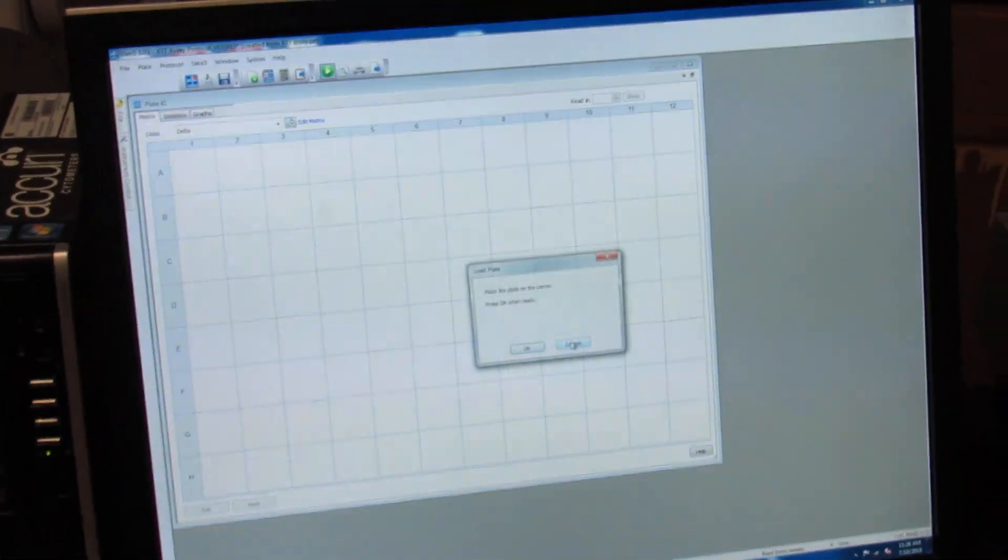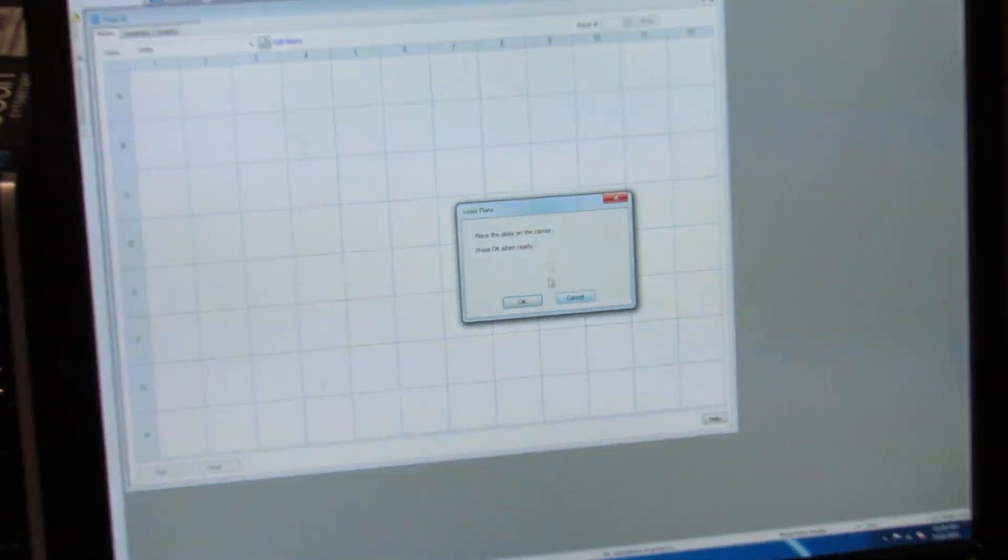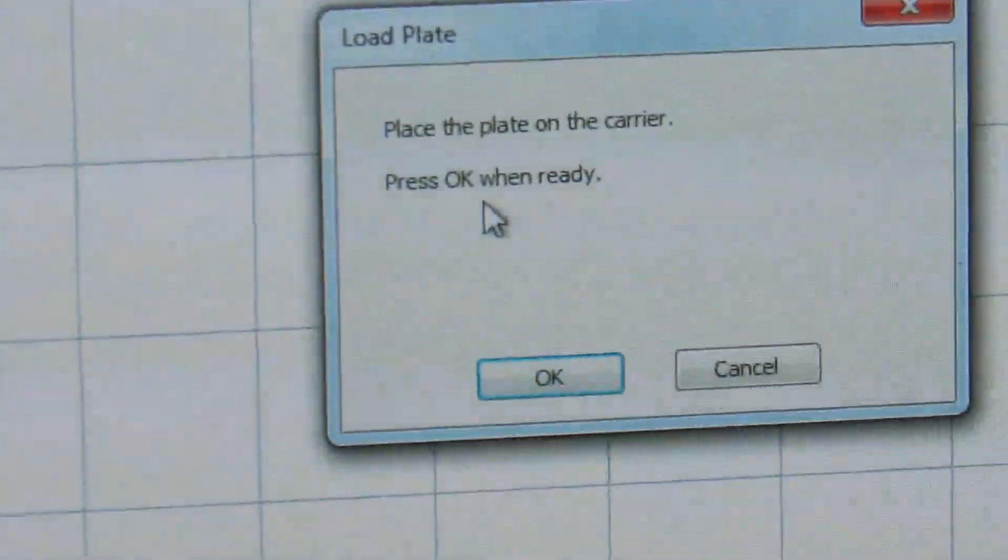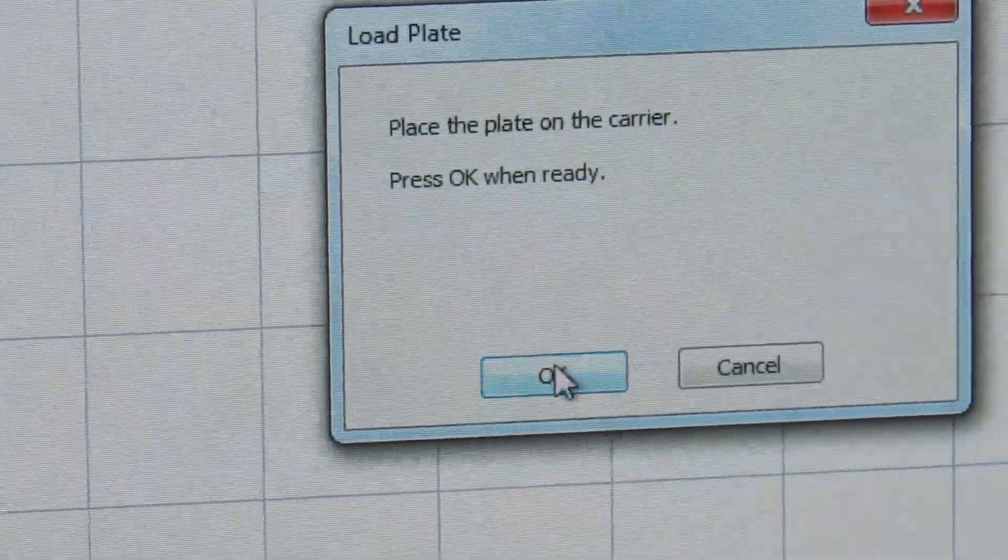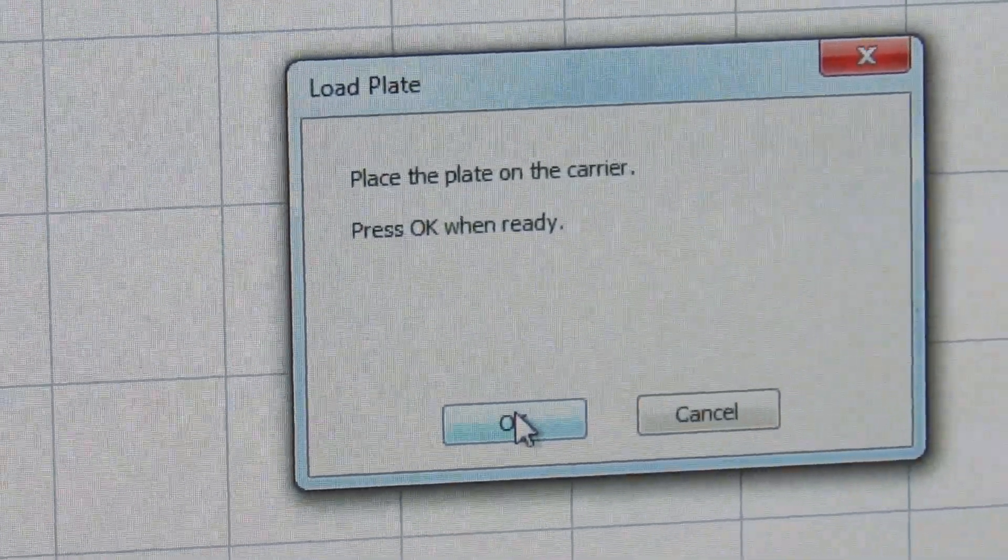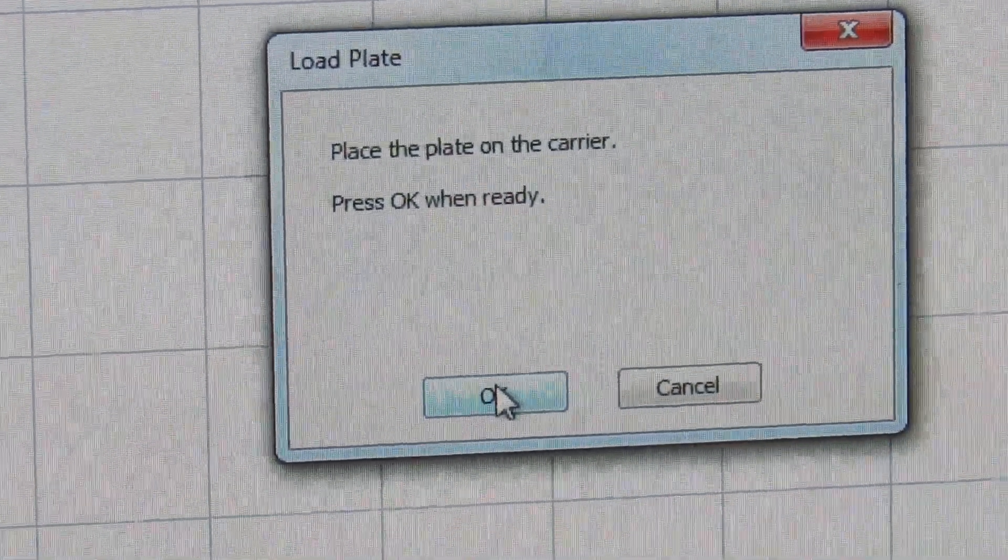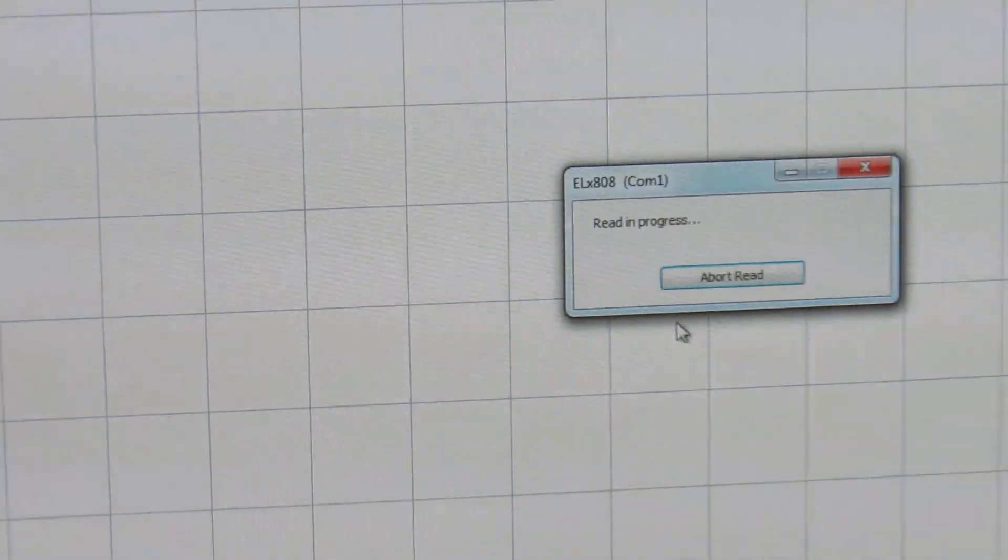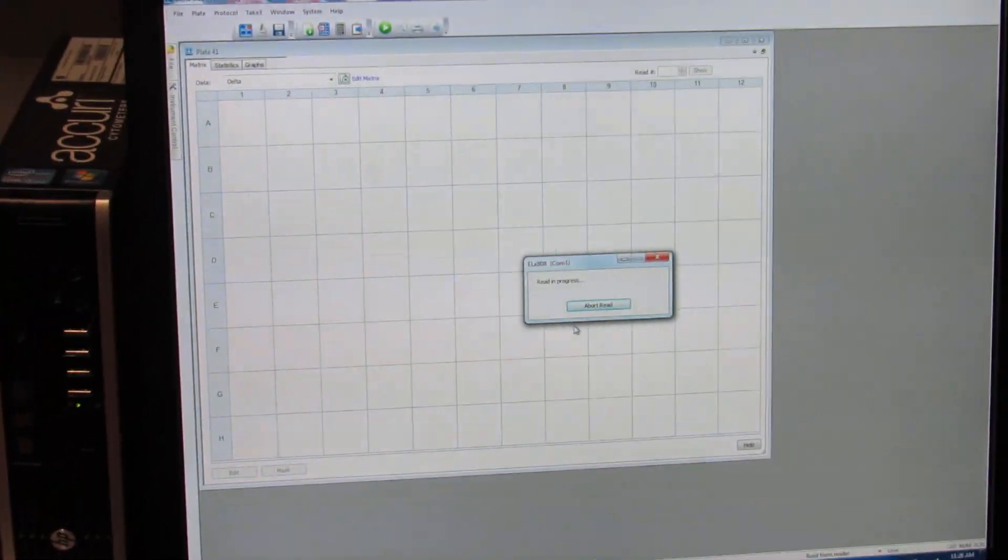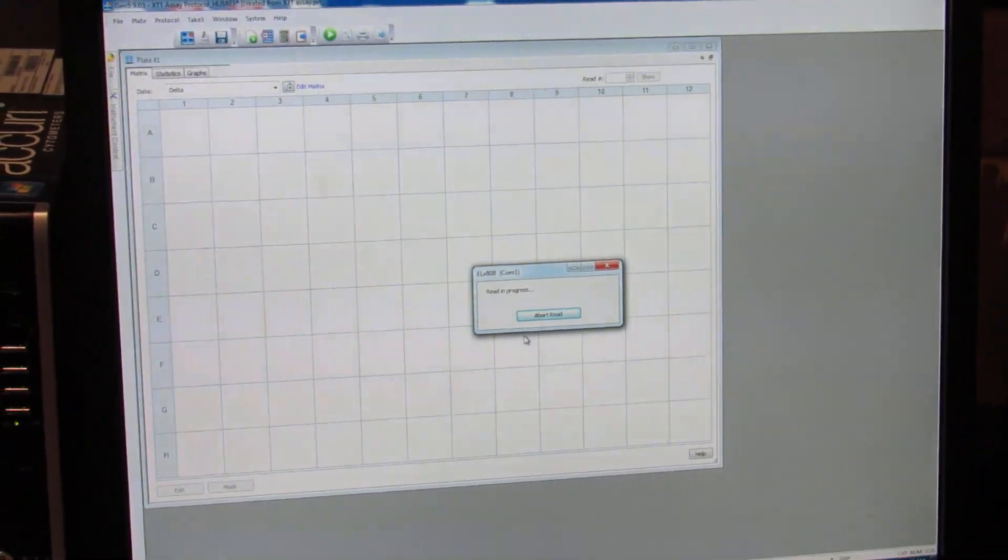The plate reader is now detecting whether or not you have inserted your plate and then it's going to ask you if you are ready to begin. Once you've placed it and it's ready to go, you will hit OK again. You will now hear the plate reader start reading your samples, which will take just a few moments.